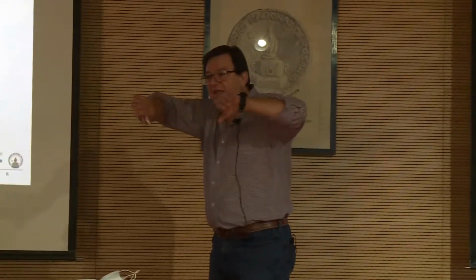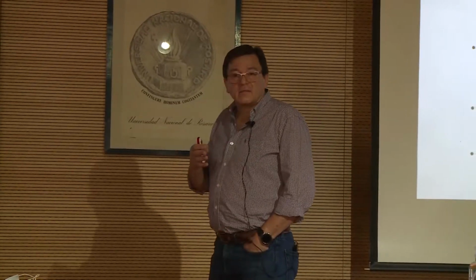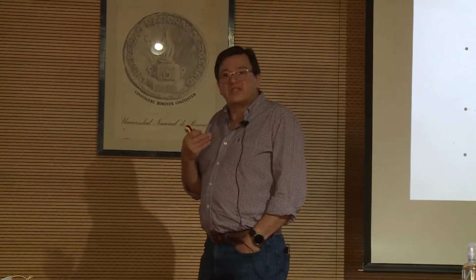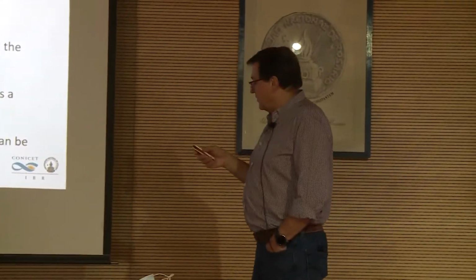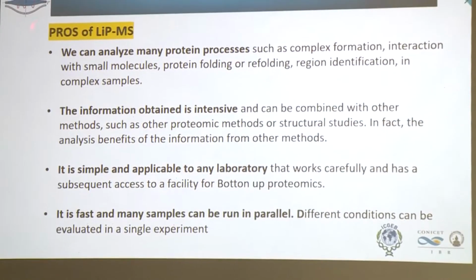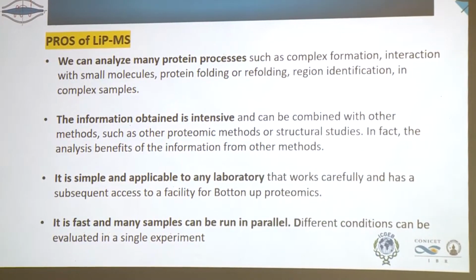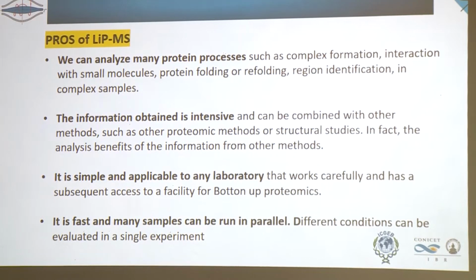So you have to clean and see which are the proteins that are interesting for us. But the advantage is that you have many processes and many proteins, so you will see complex formation, interactions, and protein folding and refolding. I will show you briefly a couple of examples now.